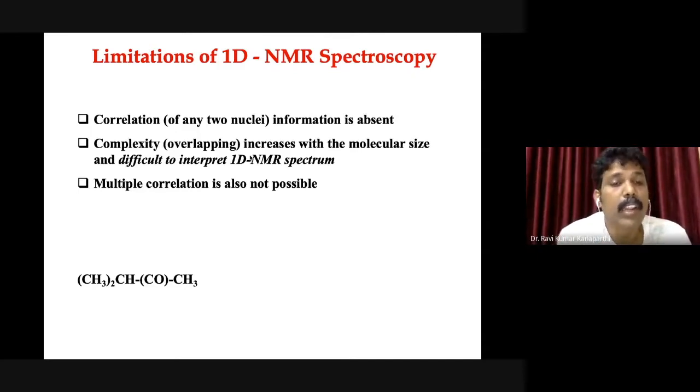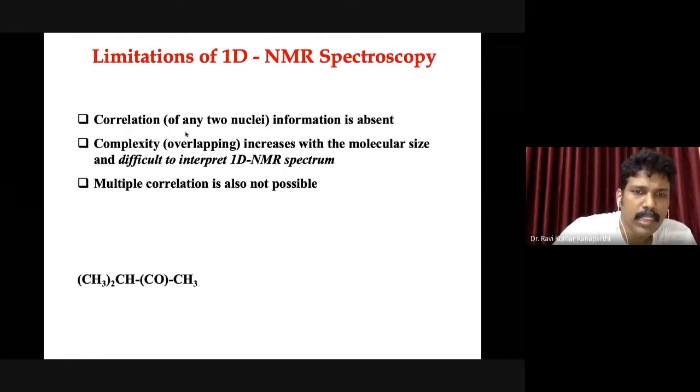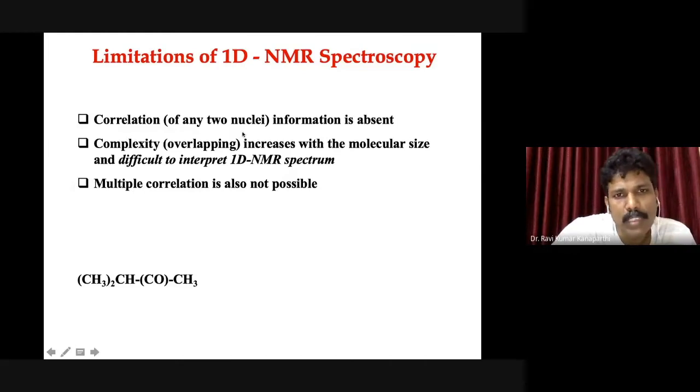Also, multiple coherences are generated, but how they correlate with each other when you excite the molecule with an RF pulse cannot be understood. These are the major three drawbacks.